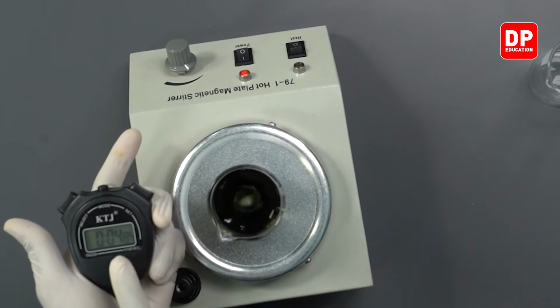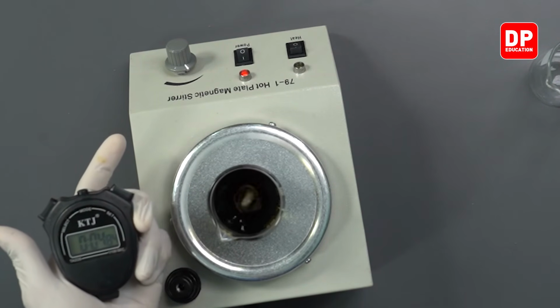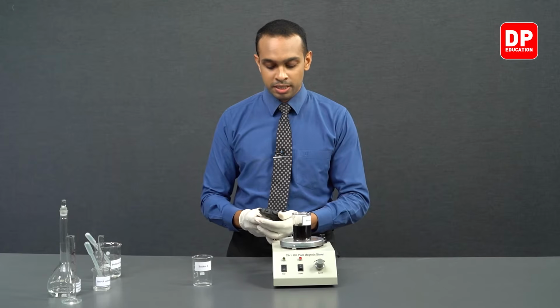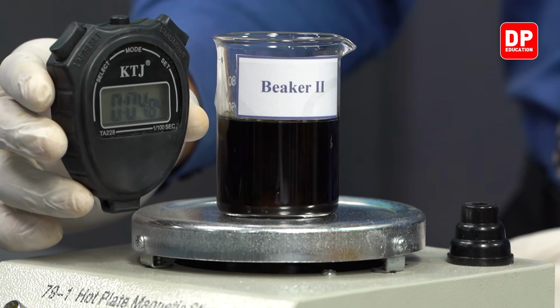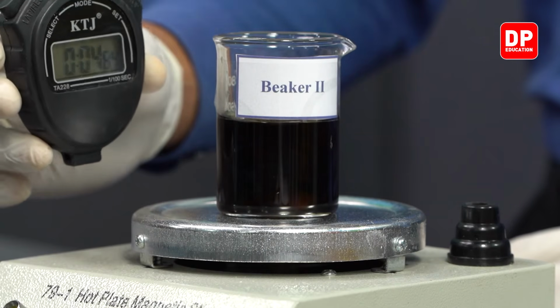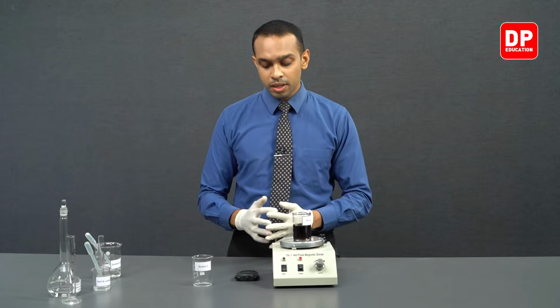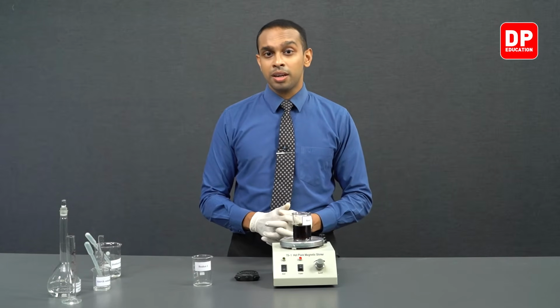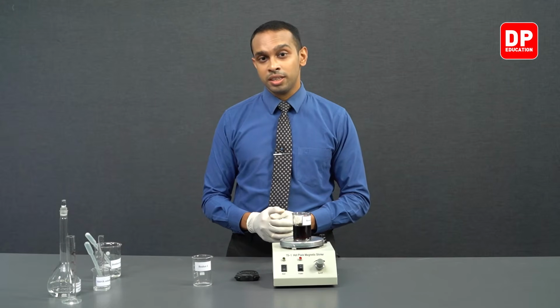It took 4.84 seconds. So as you can see, it is 4.84 seconds. Now students, you can remember in the previous one we took a little less time than this for the reaction to give us a color change.